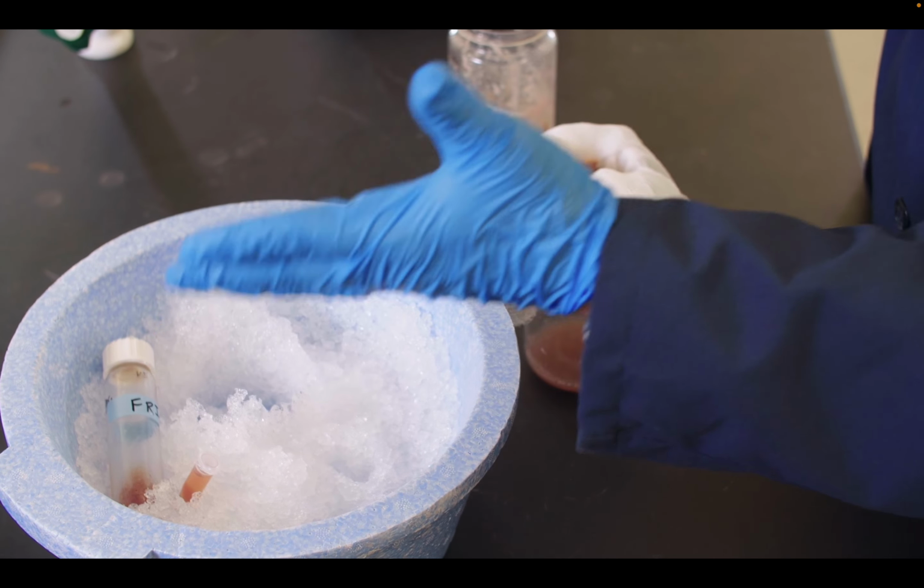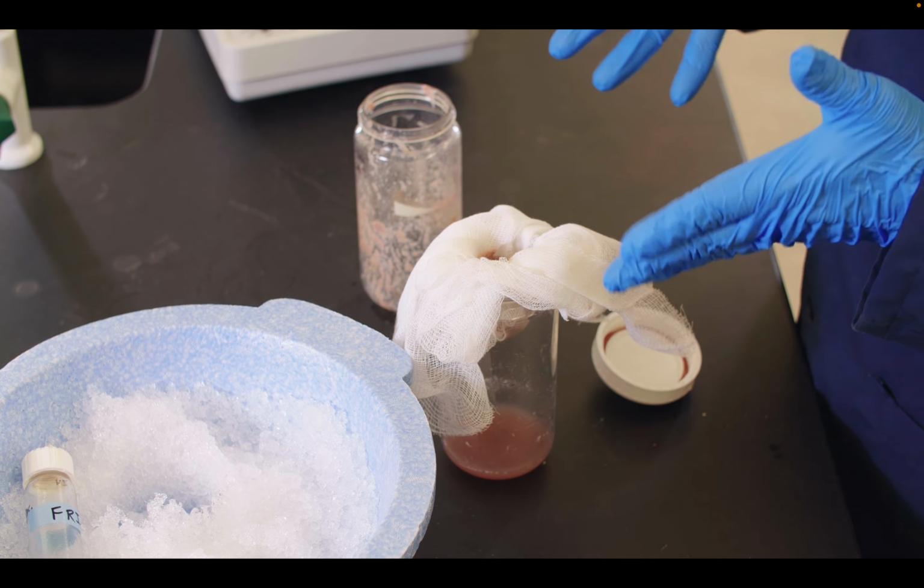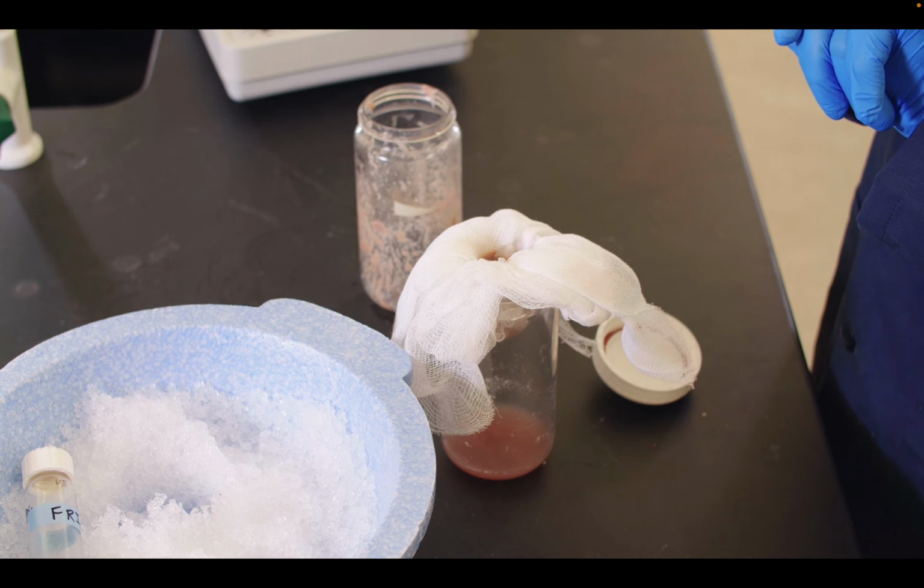We want to think about it as the entire thing that we took out of the pig heart, and then we heat denatured some of that, and we're going to let it drip. It's still dripping a little bit, and so once that finishes, then we'll be able to centrifuge this thing and actually get an assay of this one as well.